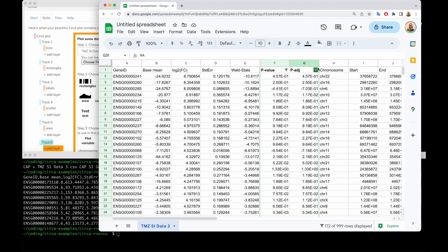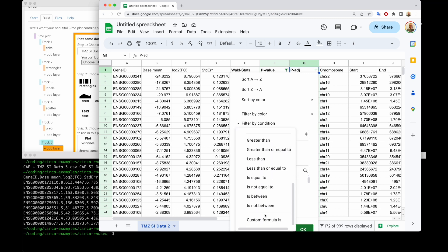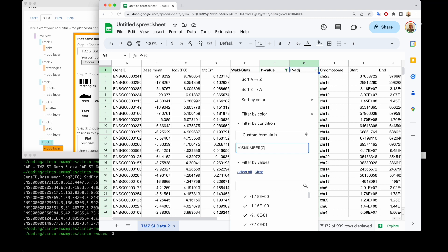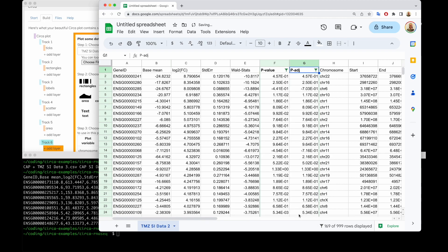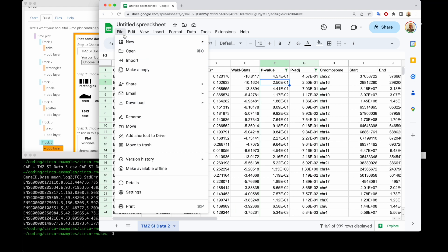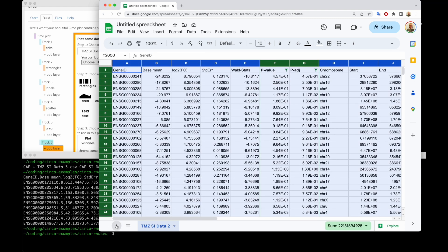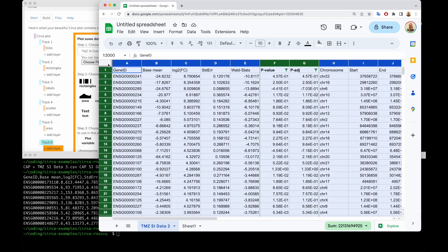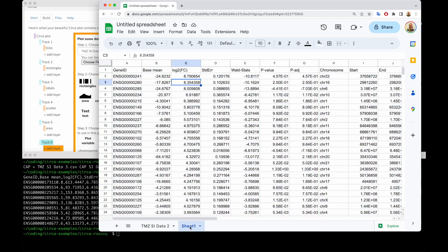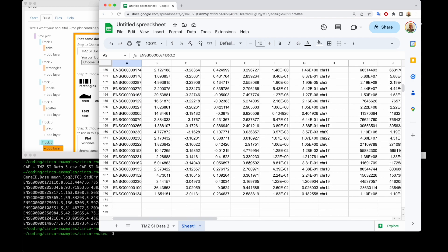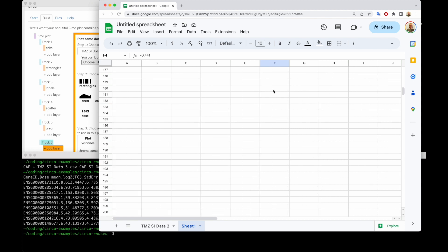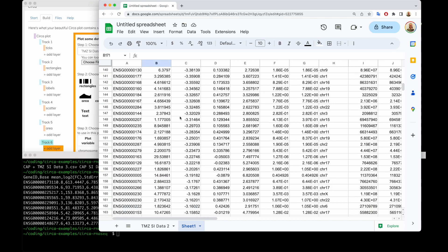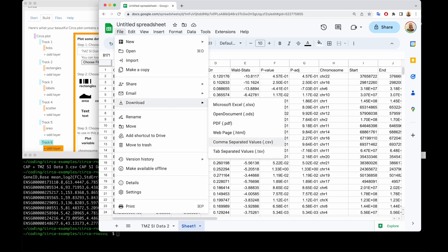There are still some NAs in column G, so I'm going to apply the same filter there: filter by condition, custom formula equals is number, and now G2 because this is column G. Now I can scroll down and see that all the NAs are gone. If you download immediately, it will still preserve those rows. So to remove them entirely, I'll select all with the top-left corner, copy, and paste into a new sheet. Now all the rows that had NAs are gone. So now we can download it as a CSV file.